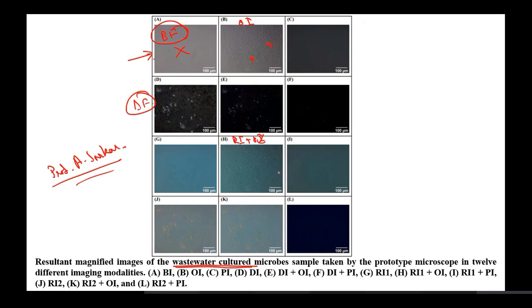These samples are so small that they were not able to pick up the information from the outer green light positions. Okay. Now, in Rheinberg illumination 2 plus oblique illumination, we had blue inside and yellow outside.